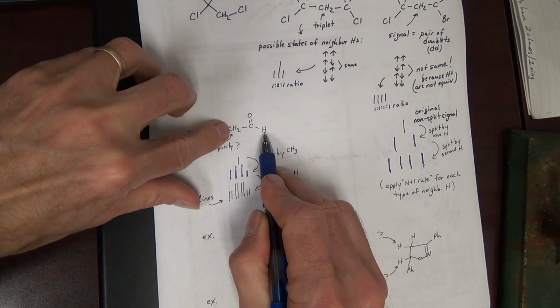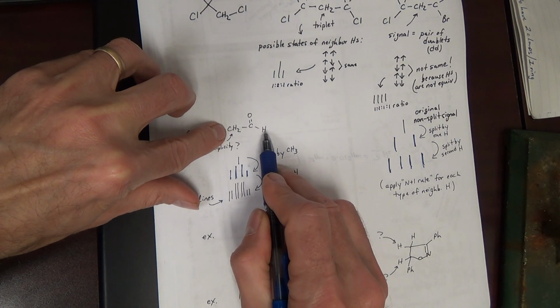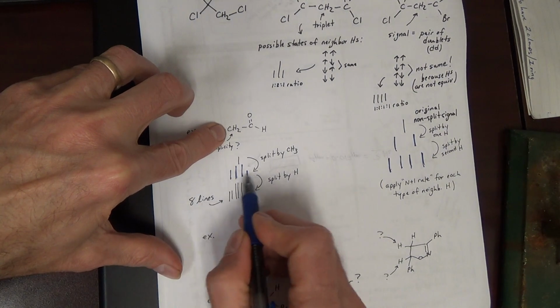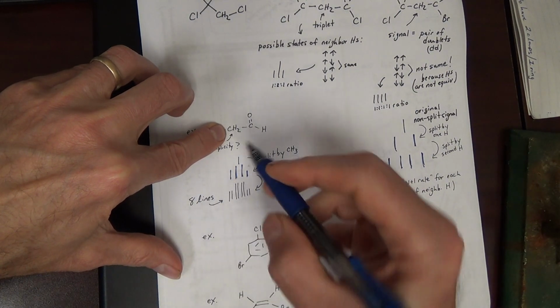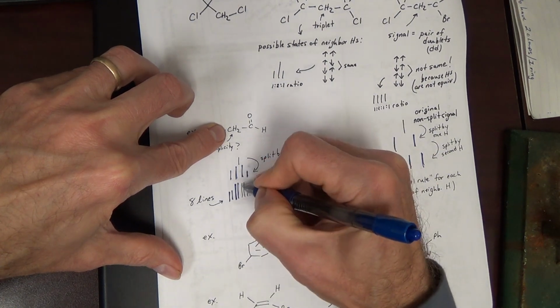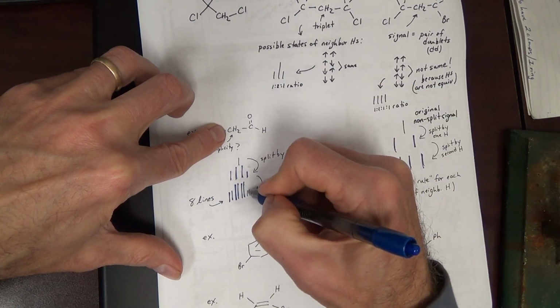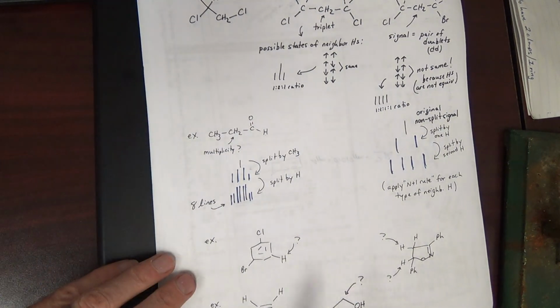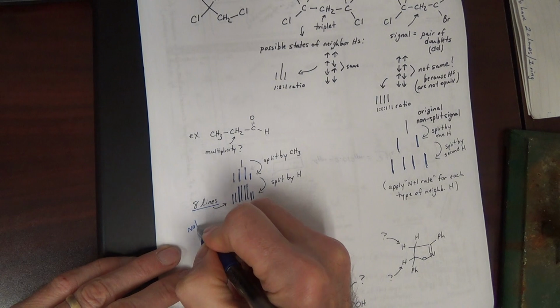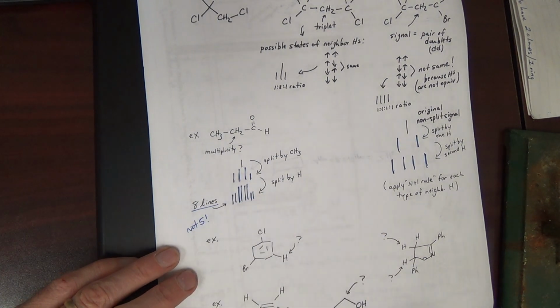That will split this signal into a doublet. n+1 is 2, doublet. What that effectively does is each line of this theoretical quartet will become a doublet. So that one becomes 2, this one becomes 2, that one becomes 2, and this one becomes 2. Your signal will look like this, and that's actually 8 lines, not 5.